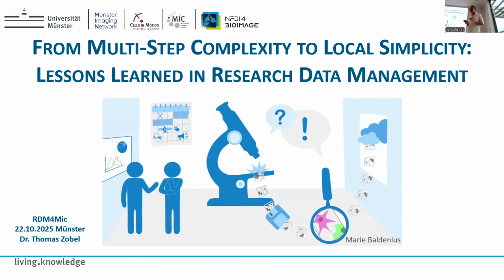First, how to train people to save their data in a nice way. Because if you're looking at the different work groups, they have completely different ways to organize their data and to save it. And if we want to use the in-place import, we need some rules for it. However, we are not in Leiden. We do not have our university at our back who says, okay, that's the plan now for everyone who's doing microscopy imaging, save it like this. We can do it on our own microscopes, but not for the whole university. So we do not have the power for it.